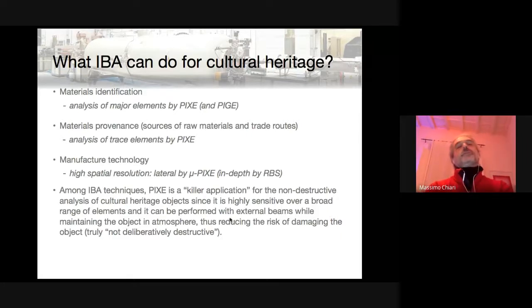But indeed, as shown also for the application to environmental samples, PIXE is a killer application in this field, because the fact that it can be performed with an external beam is perfect for analyzing samples that are precious or have very strange and large shapes, and they cannot fit in a vacuum chamber. And also because ion beam analysis is non-destructive.